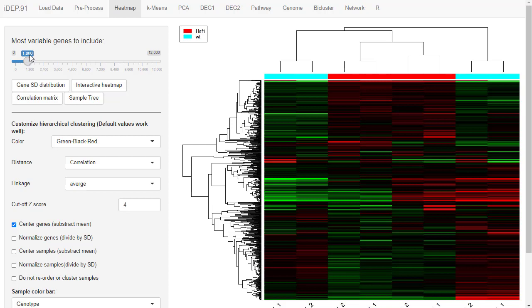For some experiments like heat shock or radiation, these experiments are dramatic to the cell. So the cell will respond with thousands of genes, sometimes even half of the genes change expression. For some other experiments, it's very subtle. Sometimes you have only 100 genes change their expression, sometimes even dozens, sometimes even none. Okay, and whatever the data tell us, it is what it is.